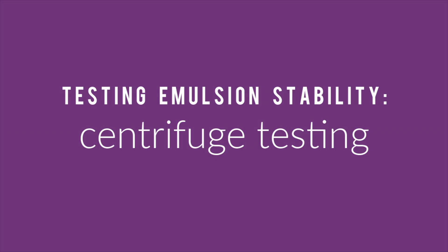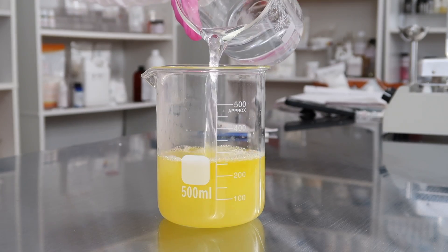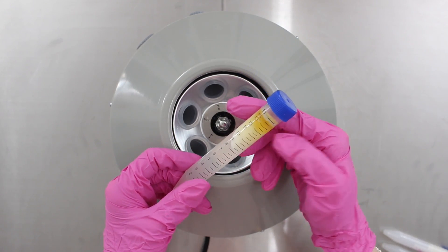The next test they talk about is a centrifuge test. They explain that the dispersed phase of an oil and water emulsion — the oil phase — has a tendency to separate out and settle on top of the product. This is called creaming, and creaming is the first sign of an emulsion failing. You can do a centrifuge test to see if creaming will occur. They also explain that the centrifuge test is especially necessary for products with powders in them, like color cosmetics, liquid and cream makeup foundations, which have a lot of pigments and tend to separate out pretty easily.